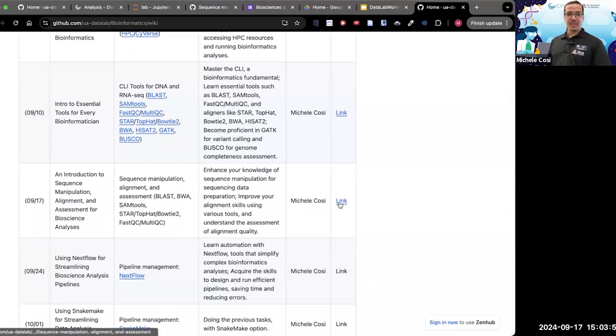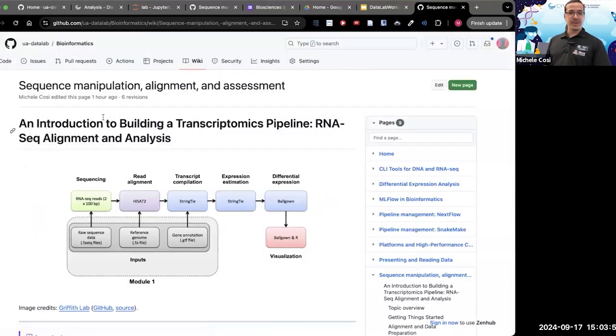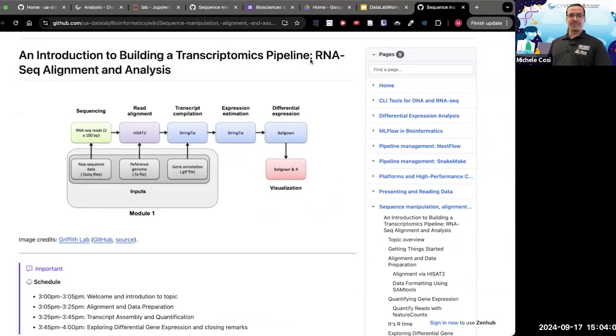So if you were to click this little link over here, it's going to open what we're going to talk about today, an introduction to building a transcriptomics pipeline, RNA-seq alignment, and analysis.